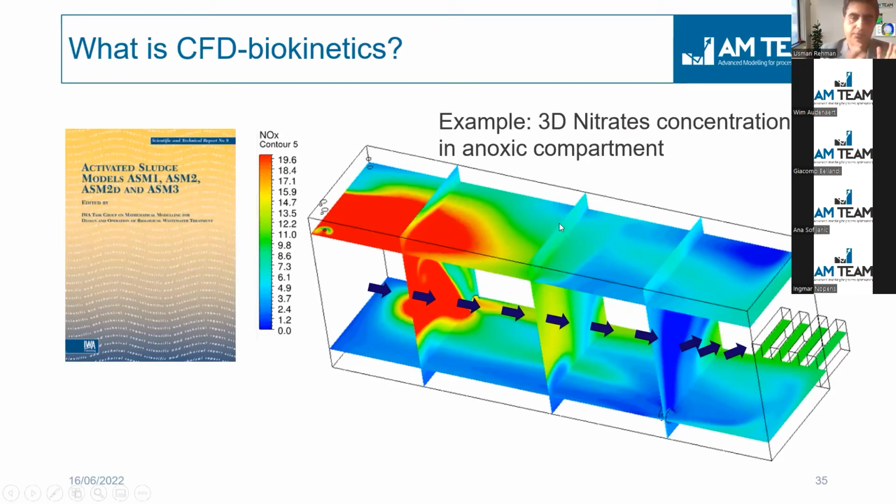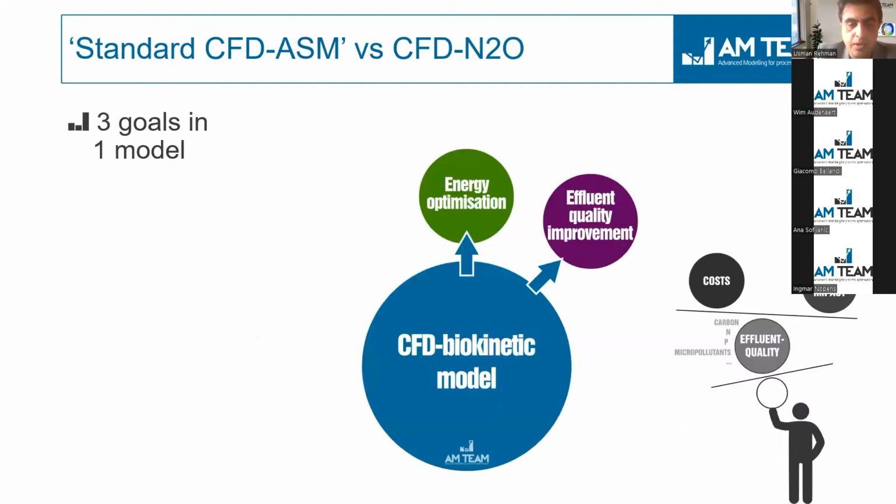By using CFD and kinetics together, you can understand the impact of your design on the performance of your biological system, and then you can run scenarios by moving your impeller or your mixer somewhere else and see if it actually improves your system or not.